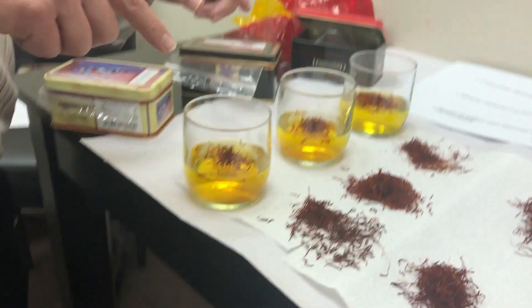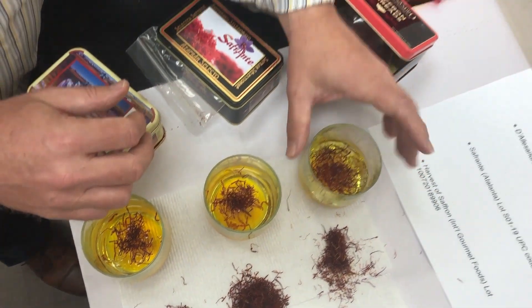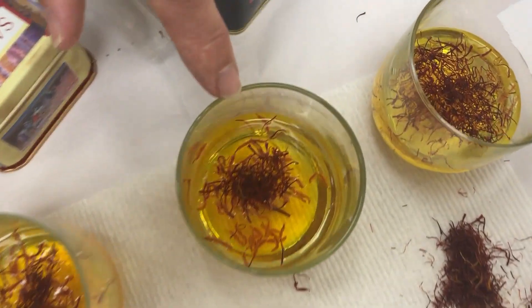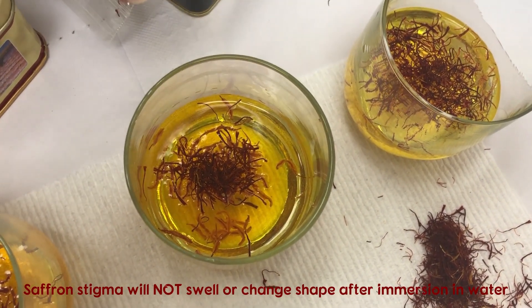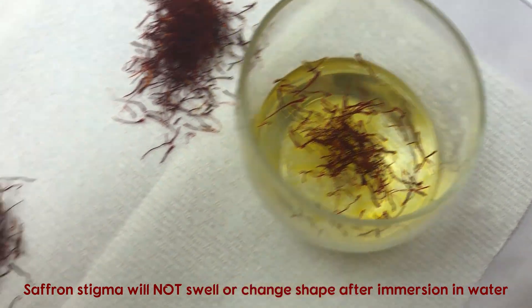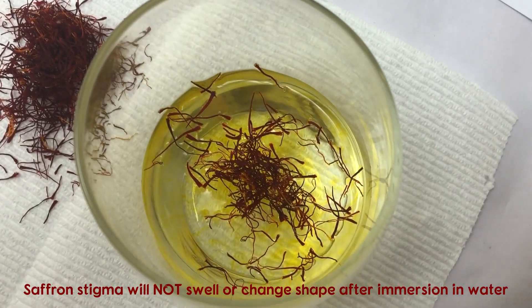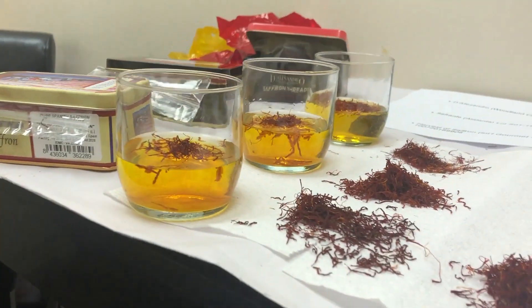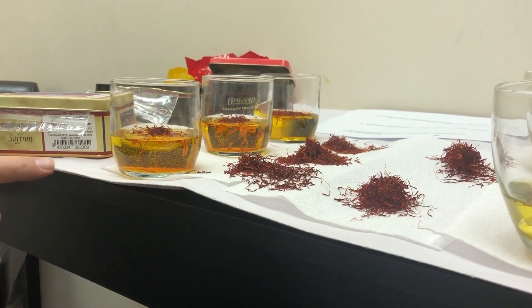Looking overhead at Harvest of Saffron, Saffrante in the middle, and D'Alessandro on top — there is a major problem with the Saffrante sample. This is not pure saffron, not even close. There are numerous threads that are immediately swelling and have already changed color after immersion in water. Saffron stigmata do not do that — they retain their shape and deep burgundy color after immersion, retaining that long elongated trumpet-like shape. They will not swell and will not sink to the bottom. In the Saffrante and Harvest of Saffron samples, some threads are already sinking to the bottom of the glass.